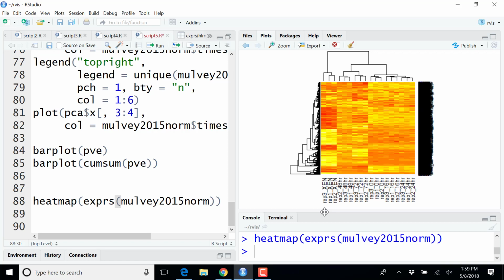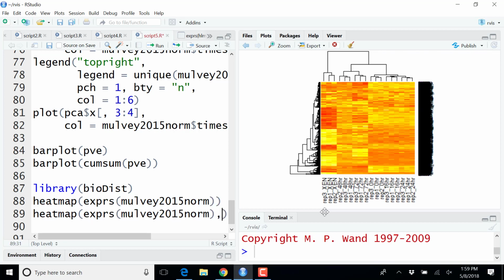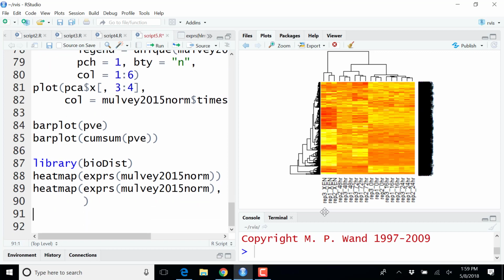But if you remember what we saw earlier, there are many parameters that can influence the result of a clustering algorithm. So we looked at this on a relatively small scale. We had 3 genes and 5 samples.